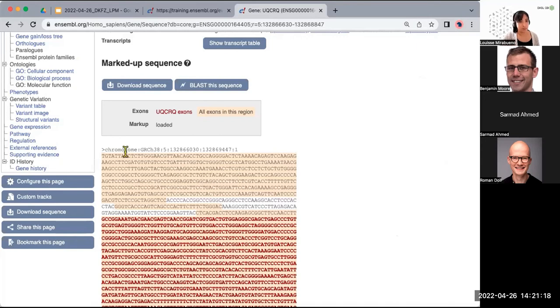That would be just plain text, just the name and the sequence, or you can also download it in RTF, rich text format. And that would be with the annotation, so with the coloring and also with a legend. Actually, I'm just going to note down to report it to our colleagues.